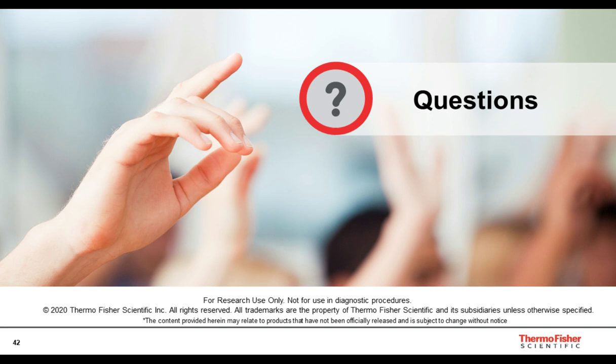That makes sense. Okay, this next question, I believe, is looking to address the TALEN or the CRISPR approaches that you talked about for nuclease cleavage. It's asking which technology has a lower off-target rate.